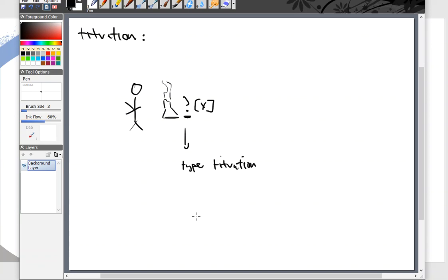However, if I'm working for a lab, most of the time there's a method that will be in place that I will simply just pull and I will follow that method. It's as easy as that. So once again, if I can read the back of a cake box, folks, then I should be perfectly okay with a titration method.